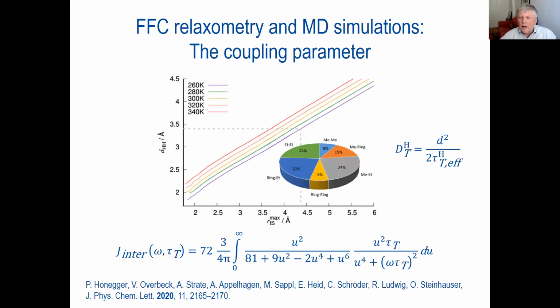One point I would like to make here too is that we know all the intermolecular proton-proton distances from the simulations, right?